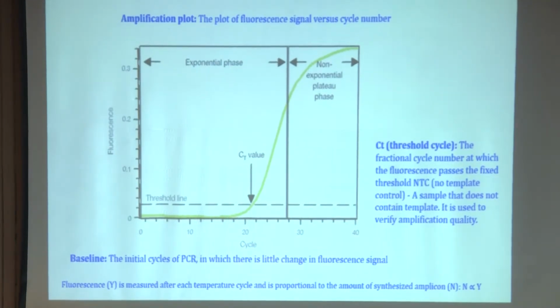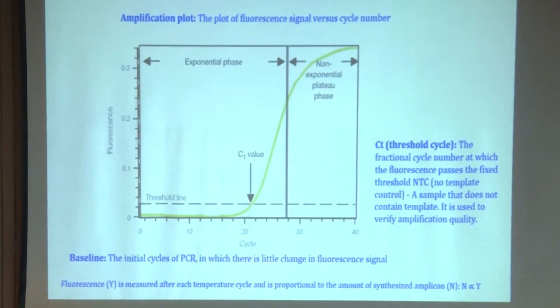When you have a reaction curve with SYBR, you won't be able to see much of the fluorescence because that's all within the baseline level. That means the fluorescence signal is just at the baseline level until a certain level of amplification happens. Only then do these molecules bind to the double-stranded DNA, and the fluorescence level will increase. When the fluorescence level increases like that, we call it the threshold cycle.